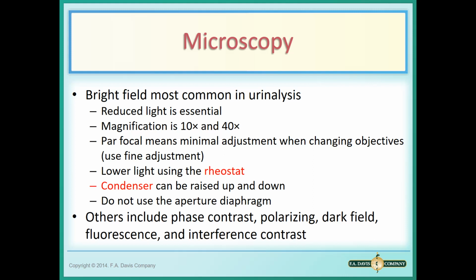We talked briefly that we can use phase contrast, polarizing, other kinds of microscope techniques. Phase is the one that we would typically see in the laboratory. Phase is one where it uses a process that, in short, splits the light beam that comes up from the light source into two different rays, and they focus differently on the three-dimensional objects within the field.